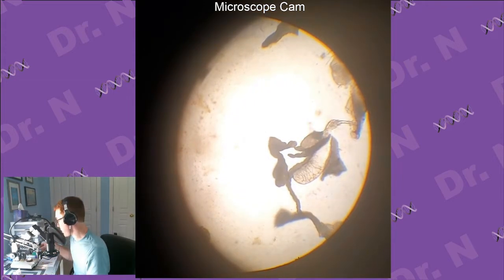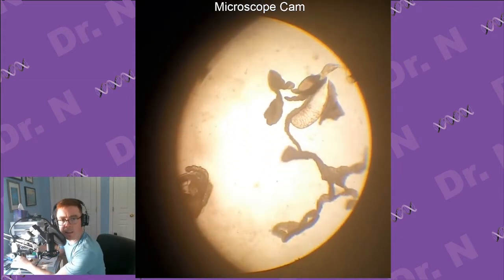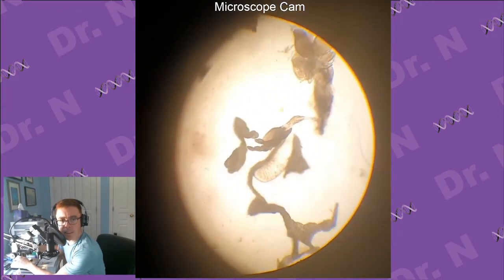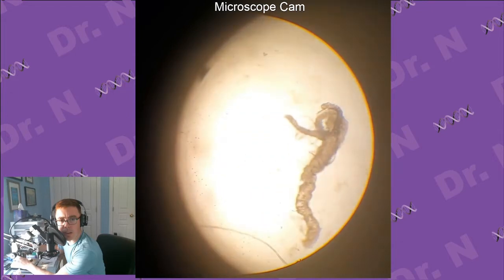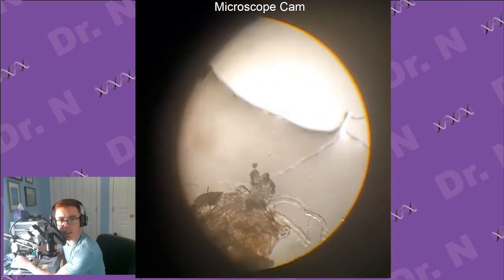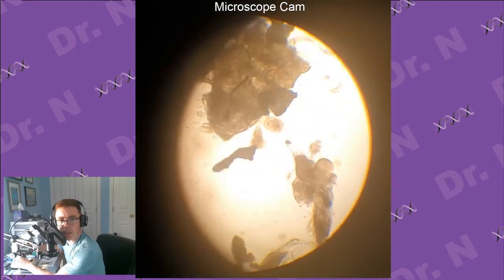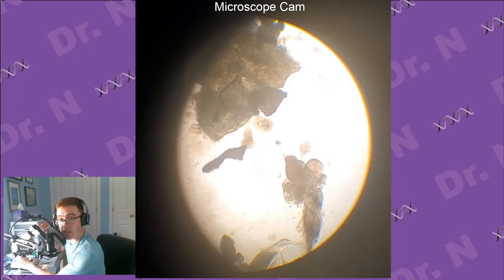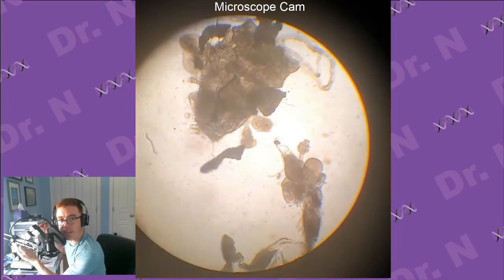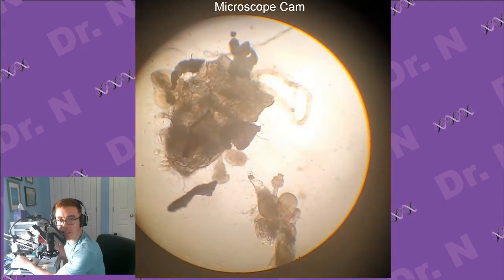It keeps floating around a little bit, but there it is. It's okay if I get some of the extra detritus, because that will all be squished away. Let's see what else we got. We just have pieces of dead fly now, or dead larva. Ah, that little sphere in the center. My camera's moving a little. The little disc near the center of the screen, that's going to become a leg someday.